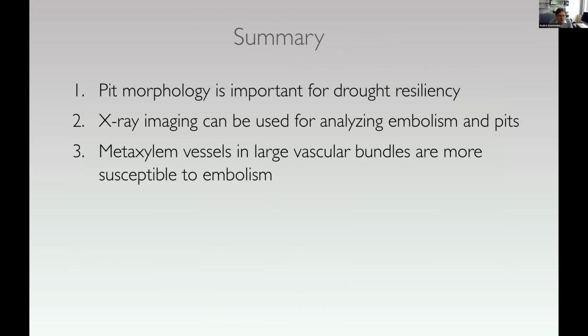So in conclusion, I just wanted to say that pit morphology is very important for drought resiliency, right? We can use X-ray imaging for analyzing embolism and pit structure. And so far we have shown that metaxylem cells in large vascular bundles are more susceptible to embolism.